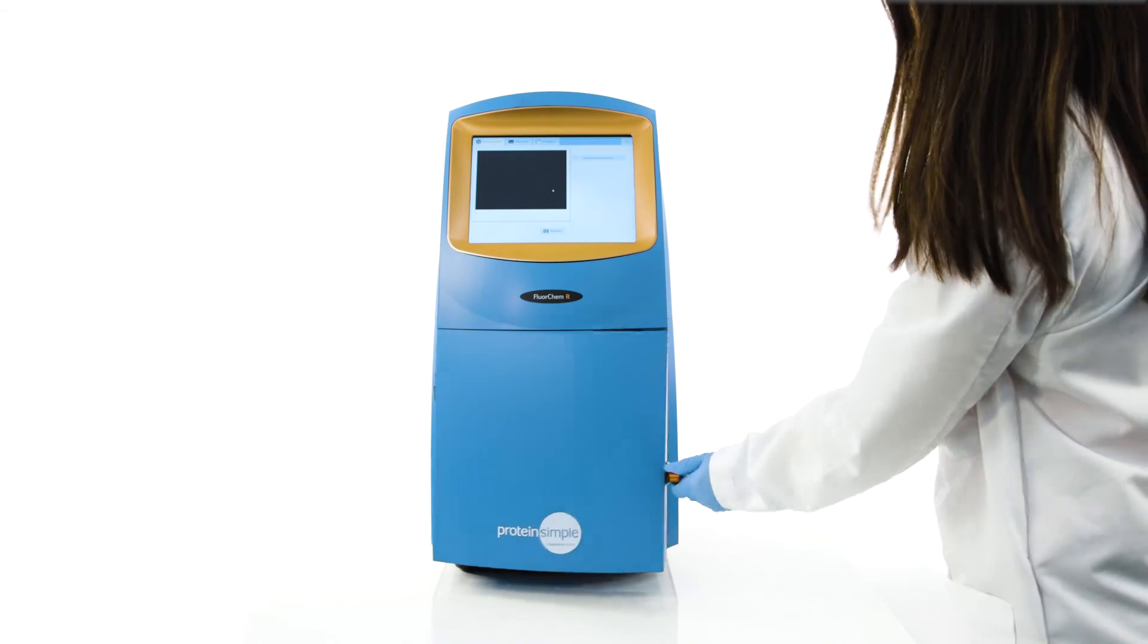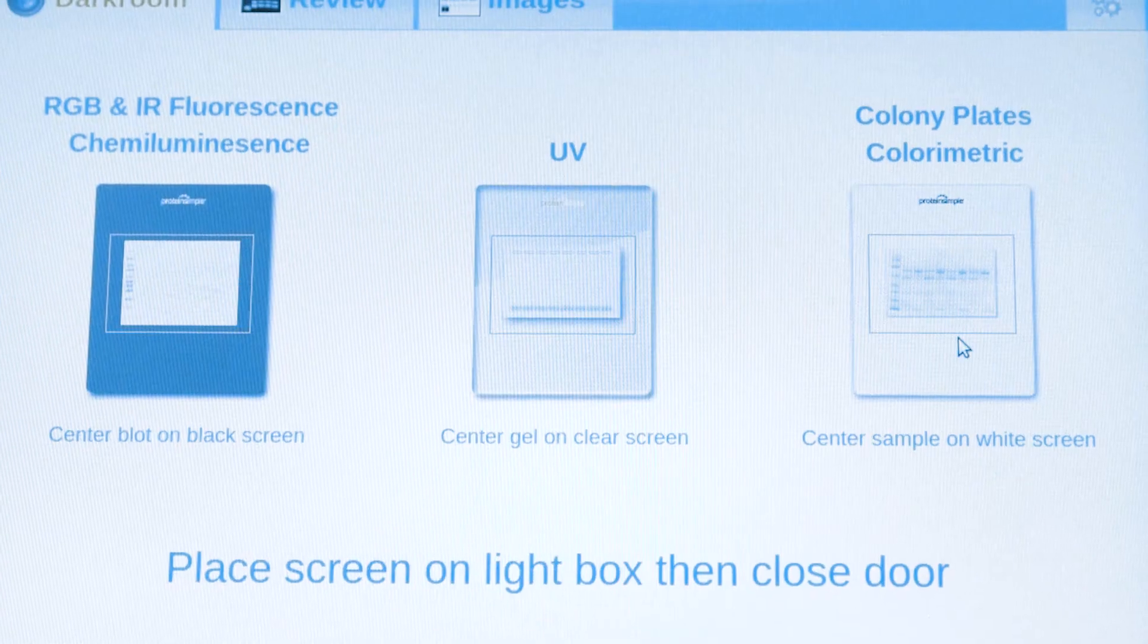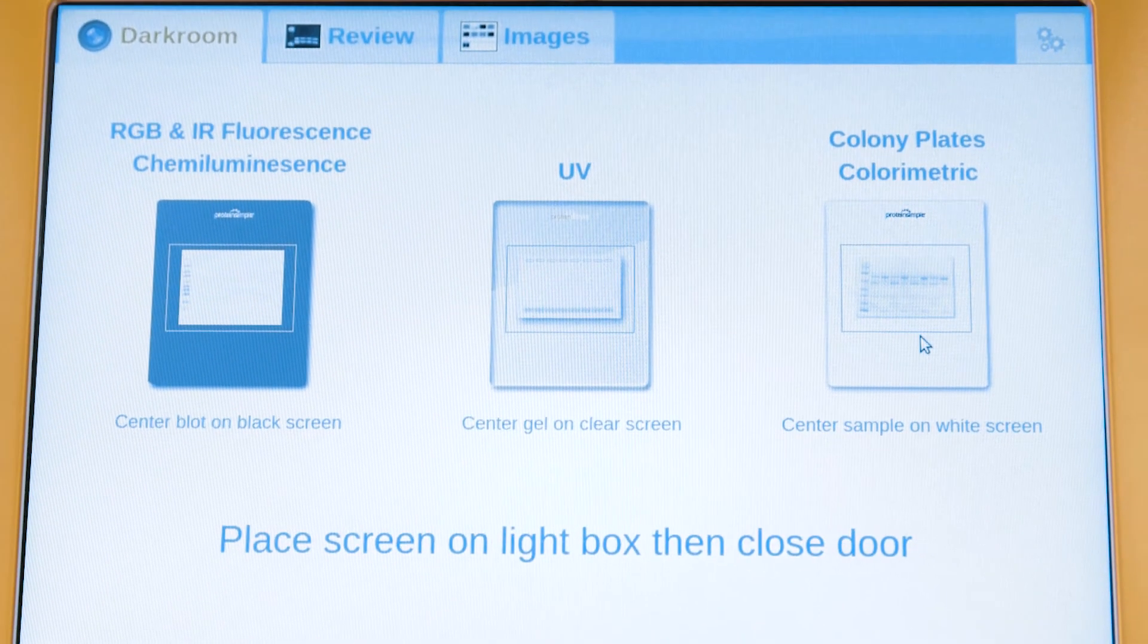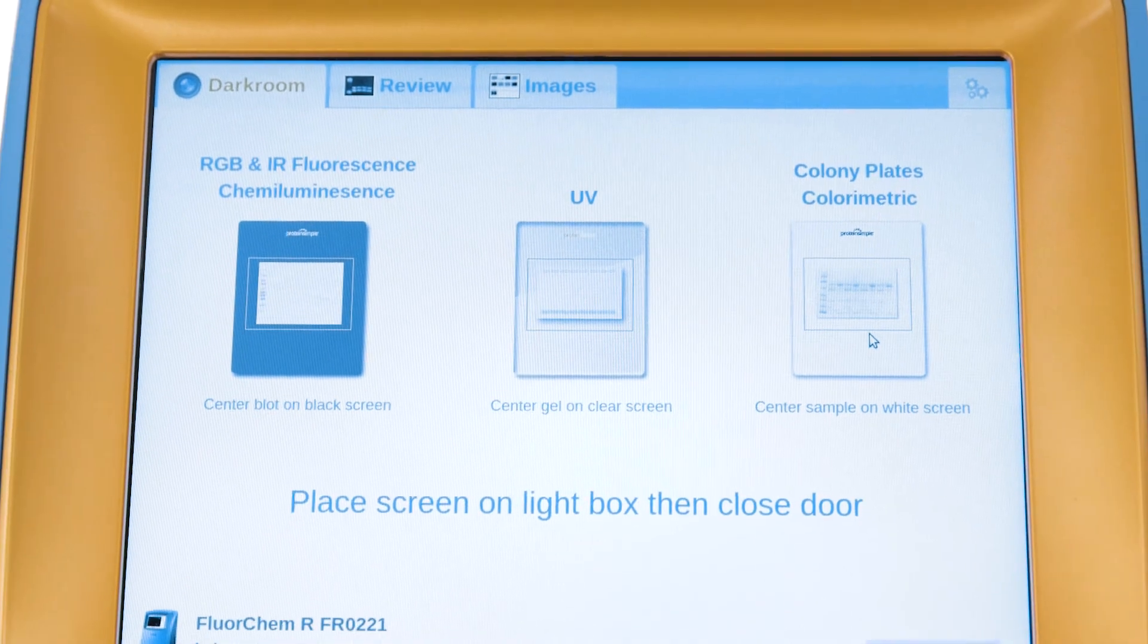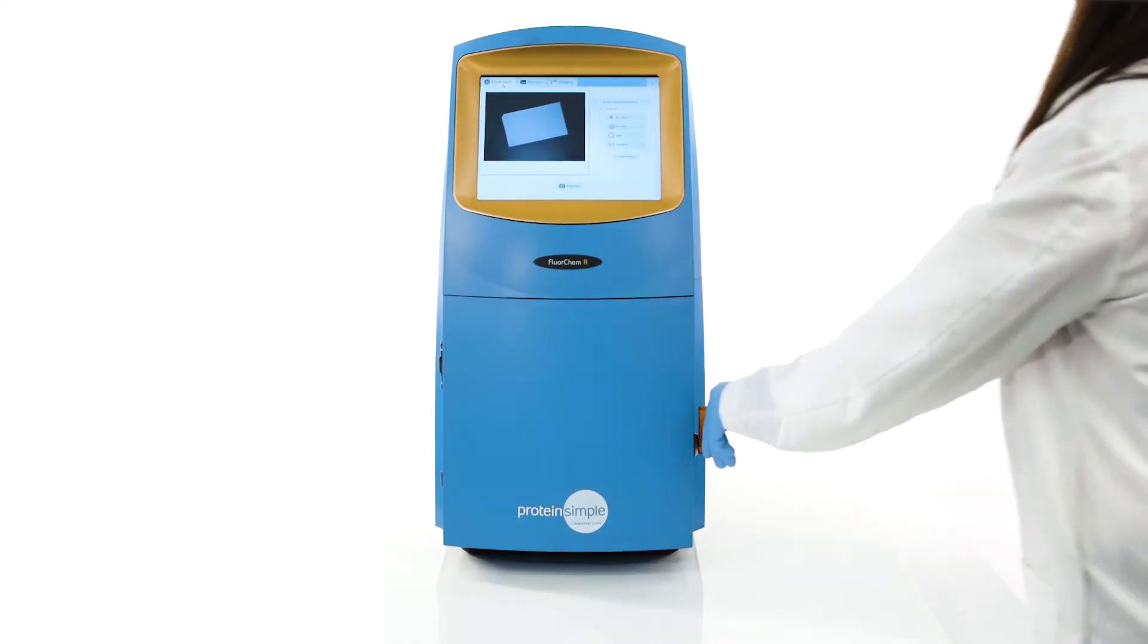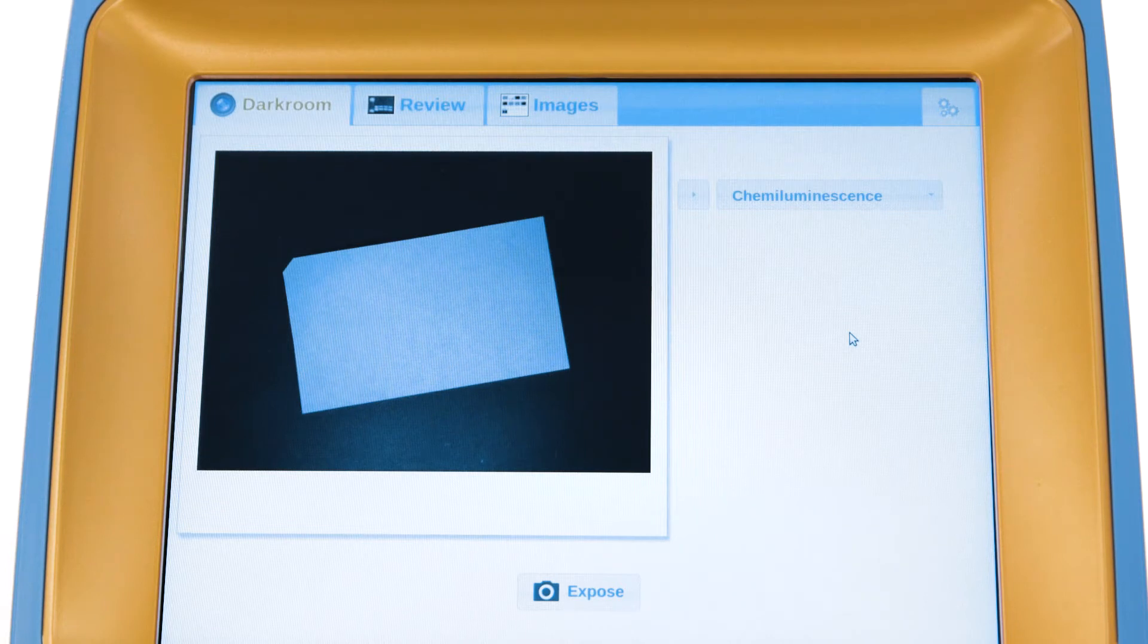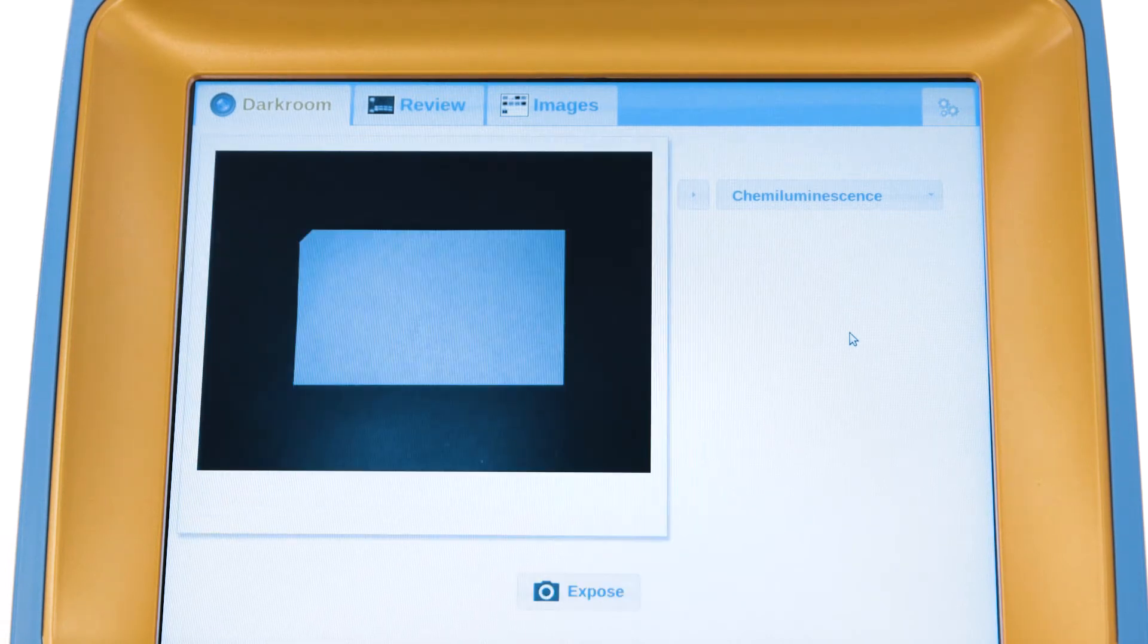When the FluorChem door is opened, the software provides a guide to the appropriate screen to use for loading a sample depending on application. Epi-LED white lights allow you to visualize the placement of the blot or gel before image acquisition.